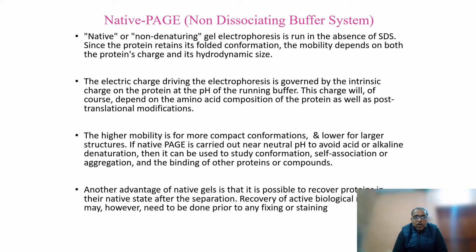studying conformations of the proteins, because that does not denature the protein. So it could be used to study the conformation, self-association, or aggregation and binding of other proteins or compounds, while it could also be used to recover the proteins in their native forms.